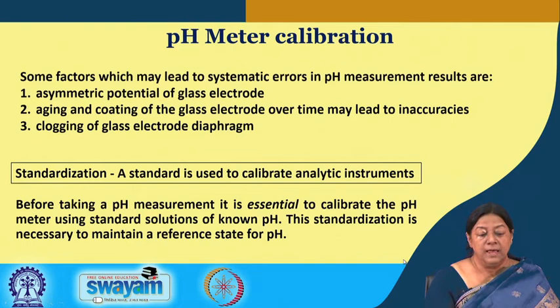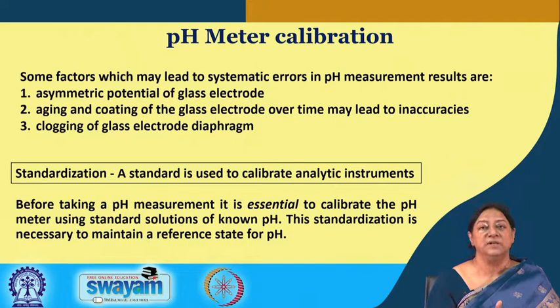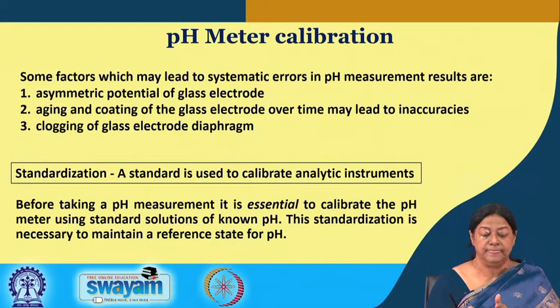Factors that can lead to improper pH measurements include the glass electrode not being stored properly, the glass electrode being old or having a coating on it, and clogging of the glass electrode diaphragm. These prevent measurement of the change in hydrogen ion concentration and therefore a change in pH.